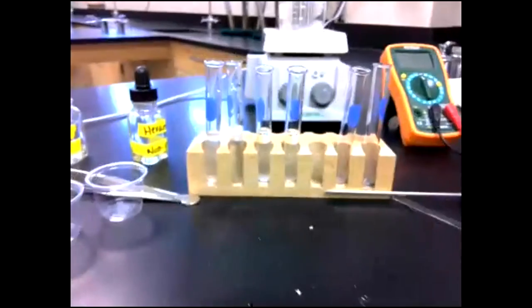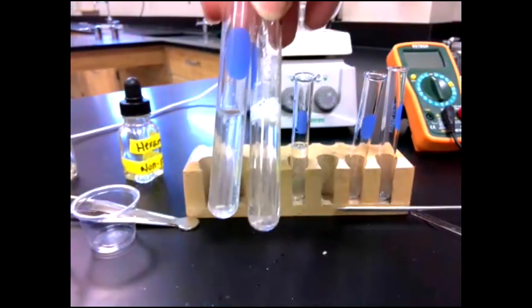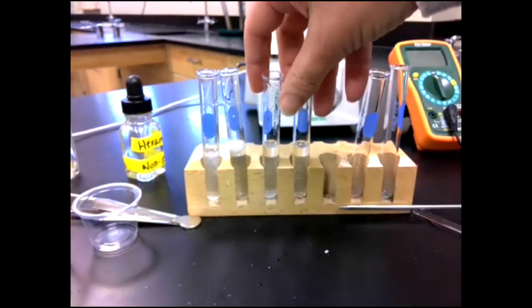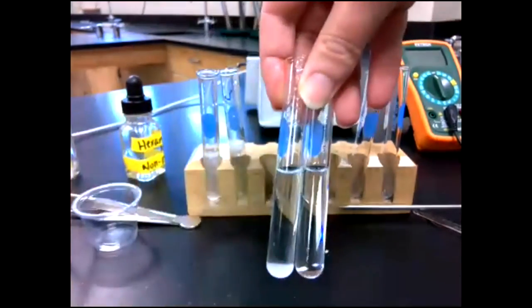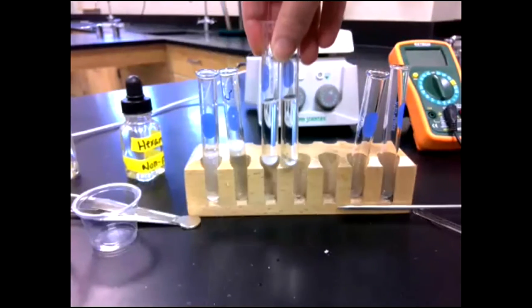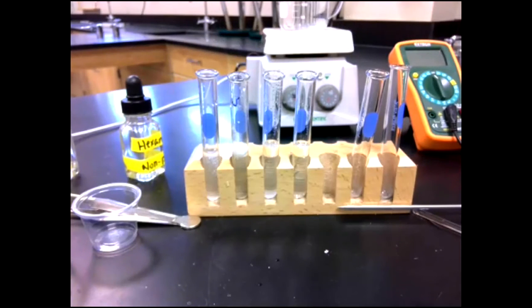Okay, so that is solubility. And again, to recap, A and B in water. So you can see them side by side, A and B. A is soluble, B is not. And then A and B in hexane. And again, A is not soluble, we say insoluble, and B is soluble. Okay, so there's a pretty big difference between them, which is good for this. Any questions? Okay, so you want to take data in your data table.